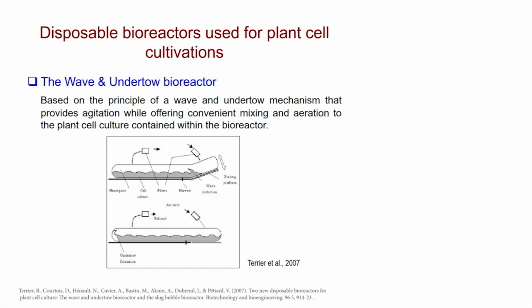So, why is this mechanism being spoken about? There is no moving part. So, what is causing mixing? This rocking motion. Now, this rocking motion would create what? Ripples, currents. So, it will create a wave at the surface.